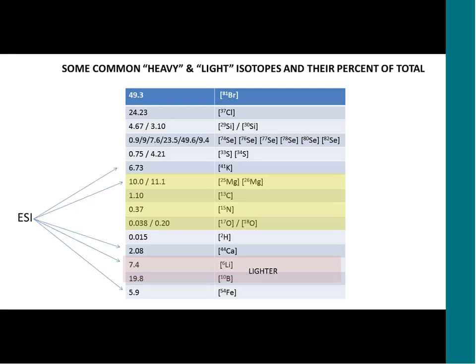It's a very common and popular mode of ionization these days. It has been for a number of years. There are cation clusters, and you're used to seeing these, of the organic molecule with a cation. Even the cations have useful isotope patterns, and I note particularly potassium, magnesium, calcium, and iron. You oftentimes can find adducts of your molecules with these nuclei, and if you look in the appropriate place, you're going to find isotope information, and that can be very useful.